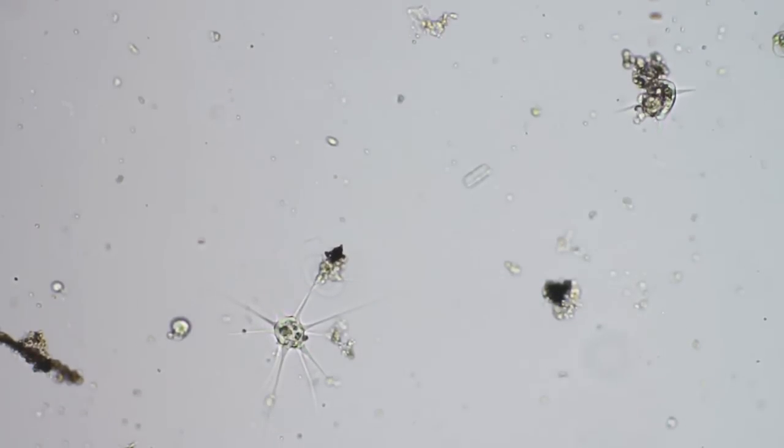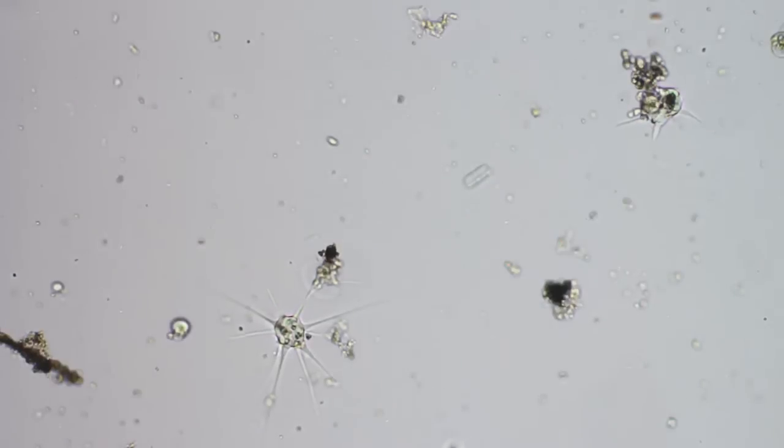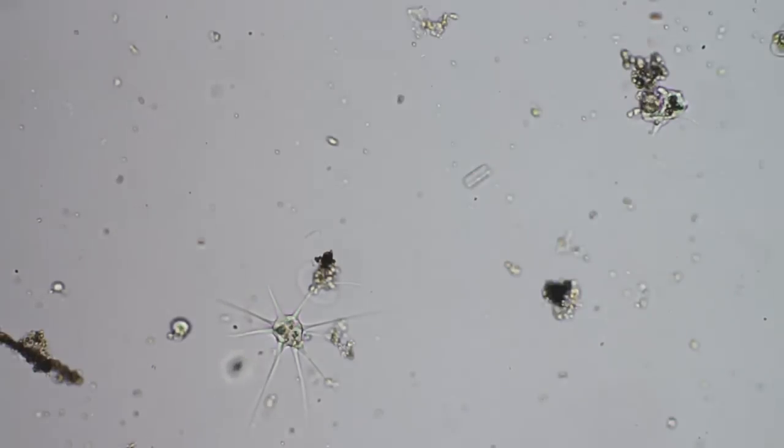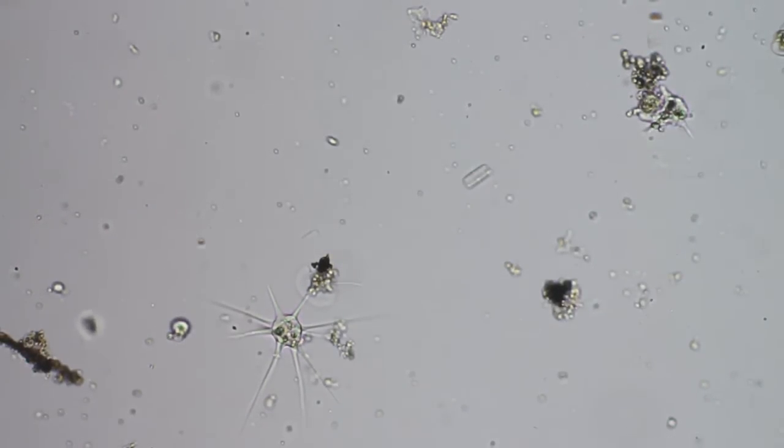This amoeba is either engulfing whatever he's got there, or he's camouflaged himself, or it's another star shape. It's got him some chow. Let's see if I can get some contrast here going with the field diaphragm.